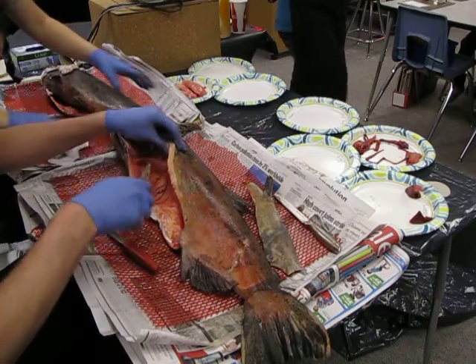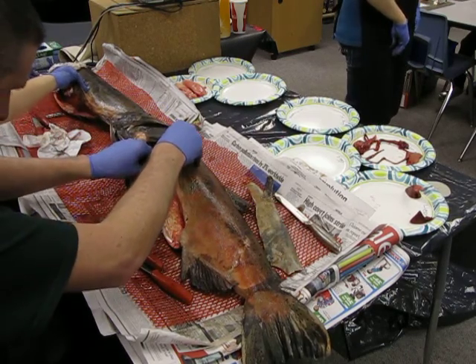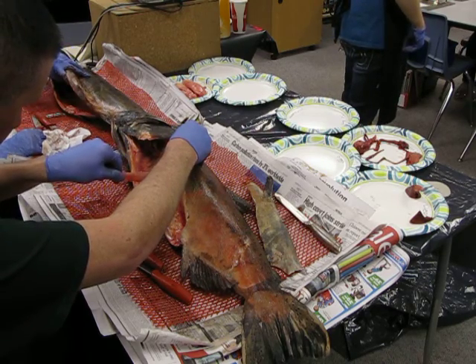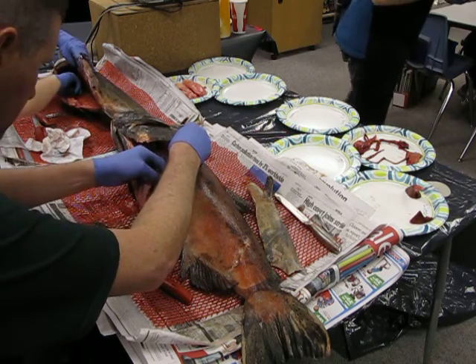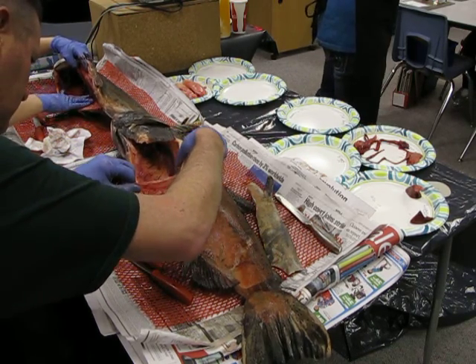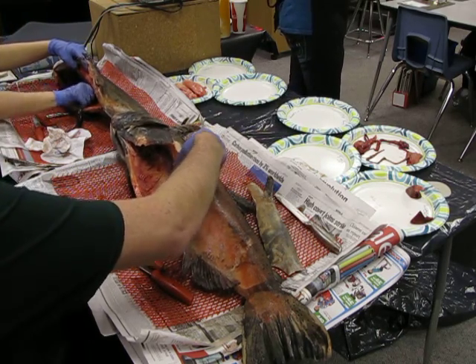What would the female have inside of her as a spawner? What do you think? Eggs, you got it. The female salmon usually carry about 4,000 eggs inside in 2 egg sacs. So they're kind of like bags. They keep all the eggs together. But if we were to have eggs here, which unfortunately we don't, but they've never been alive, okay?